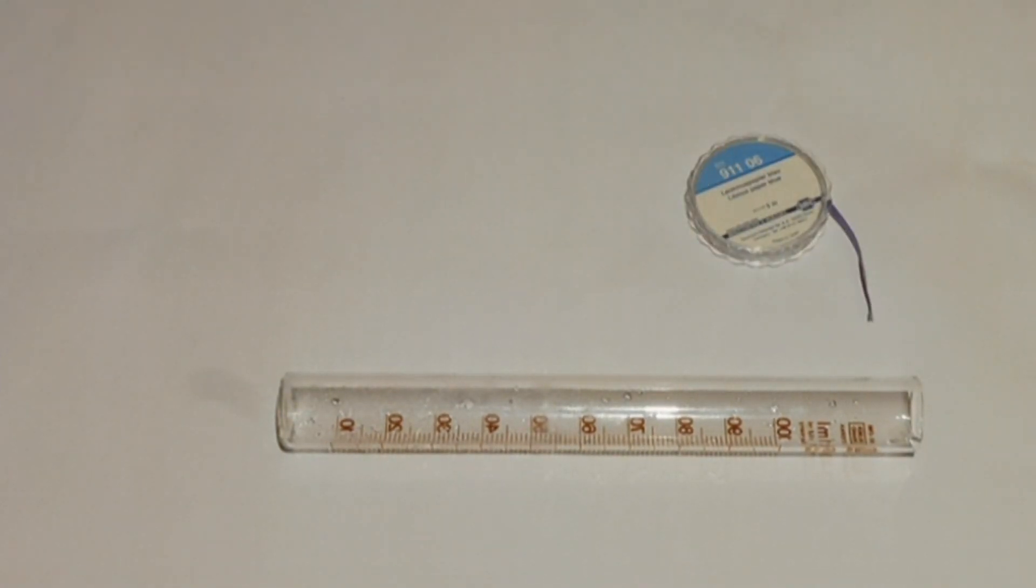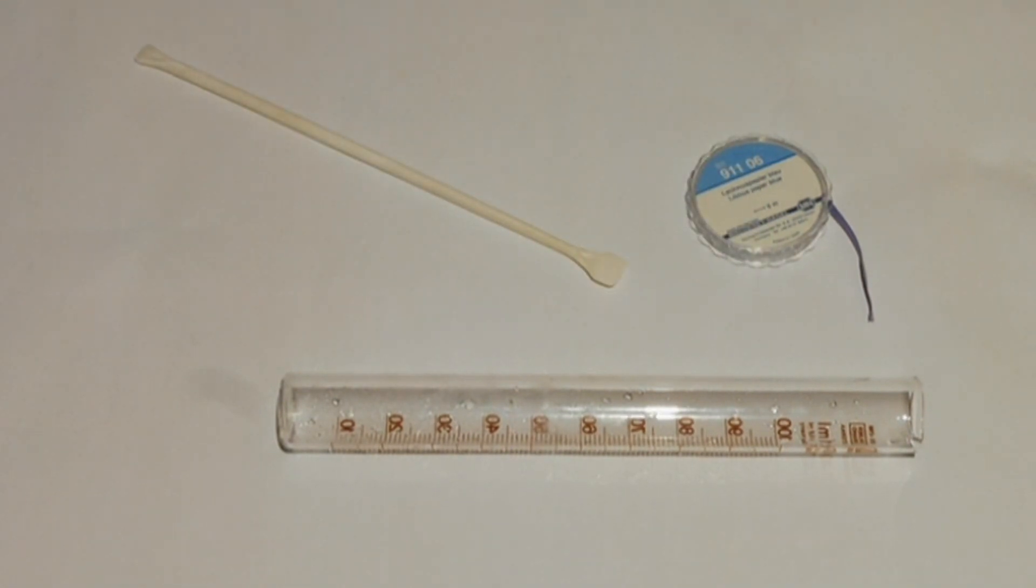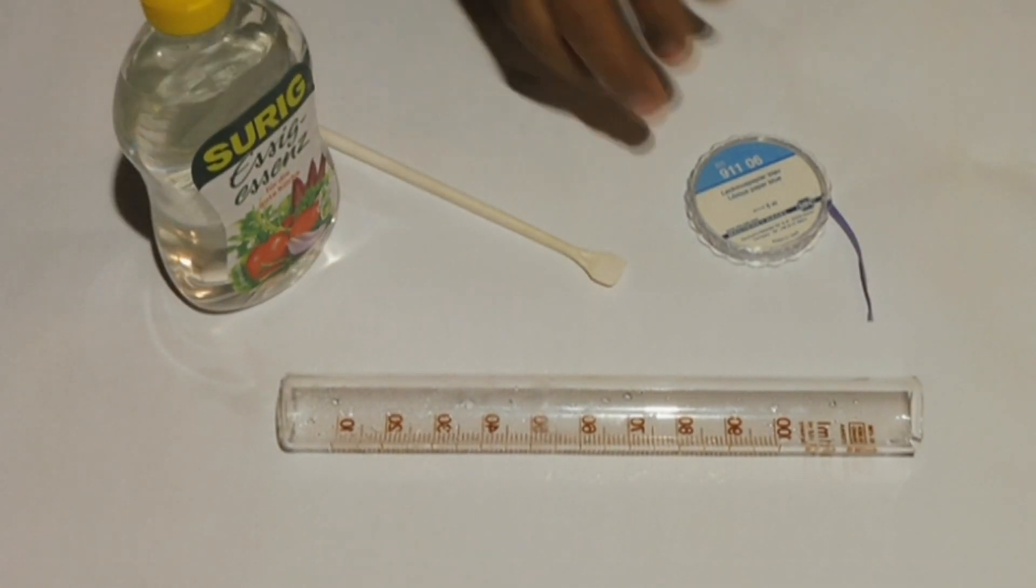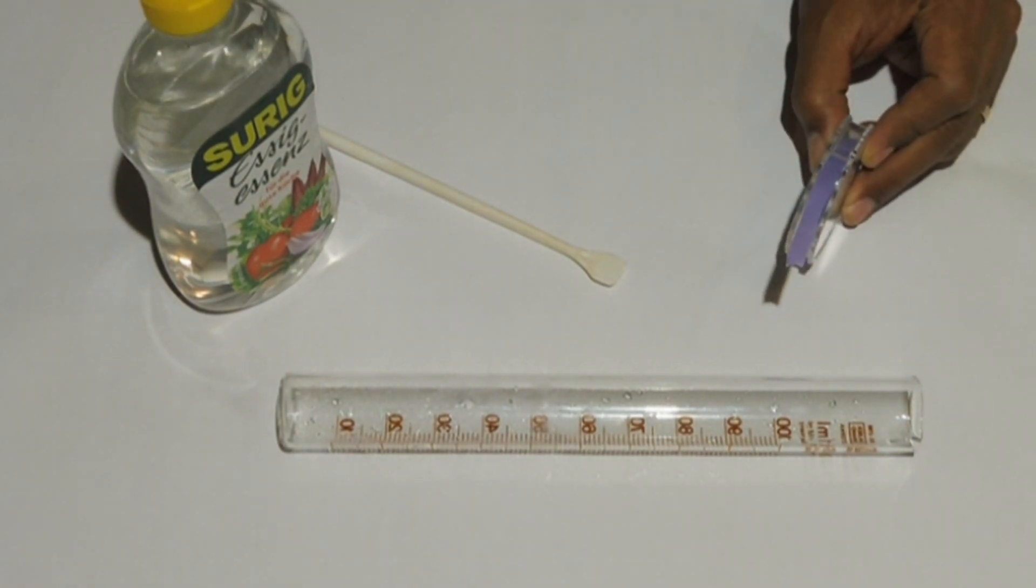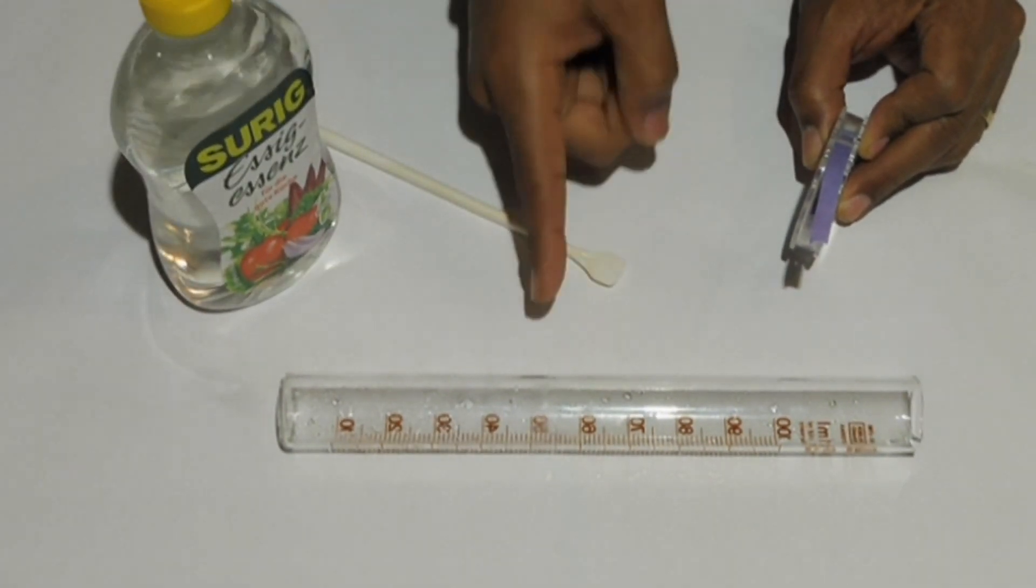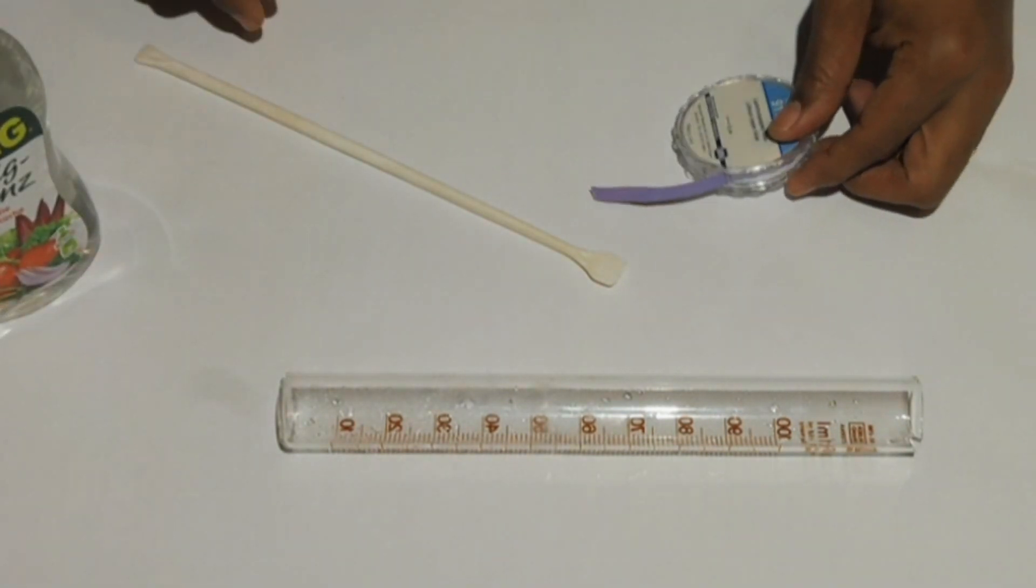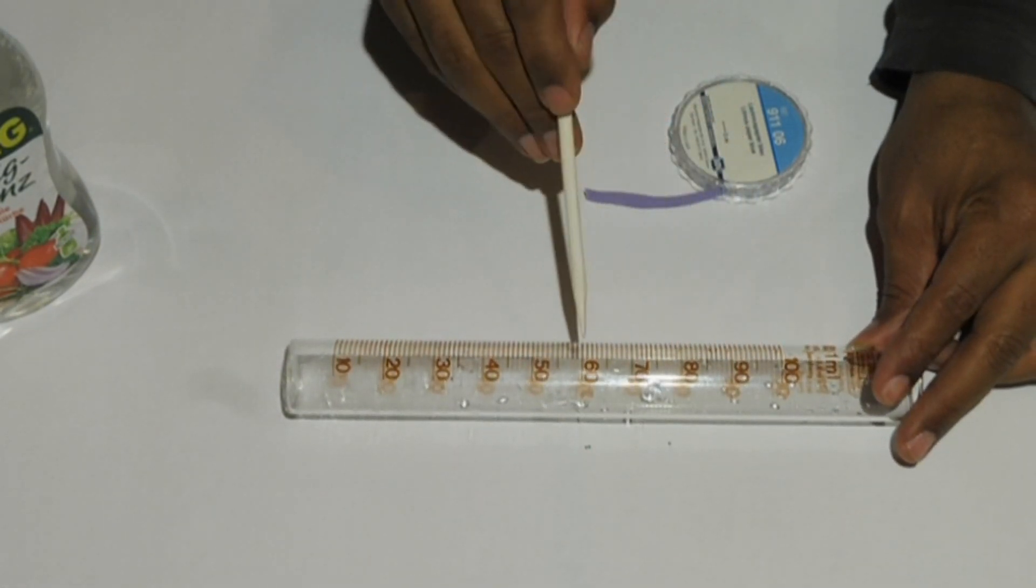Take the litmus paper and the stirring rod. The rod will be used to insert the litmus paper into the graduated cylinder. Take the vinegar, which is our acid. Acids change the color of blue litmus paper to red. When the litmus paper changes to red, it will show that the vinegar vapor is at that location.